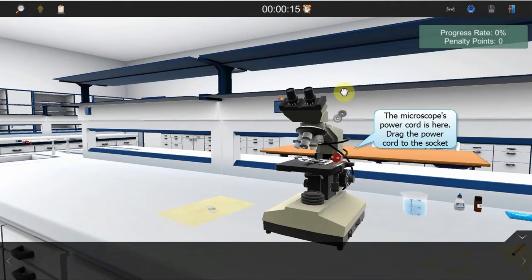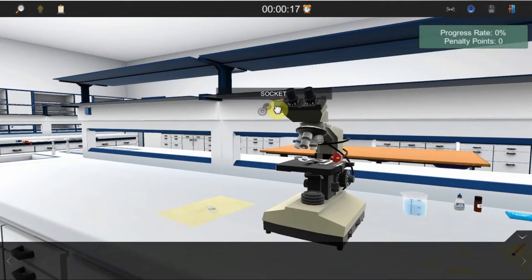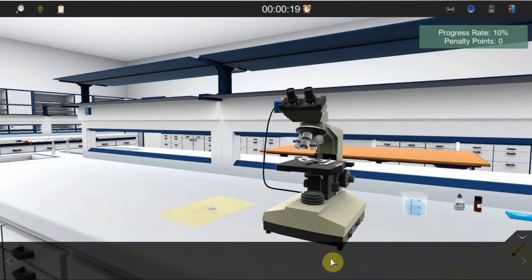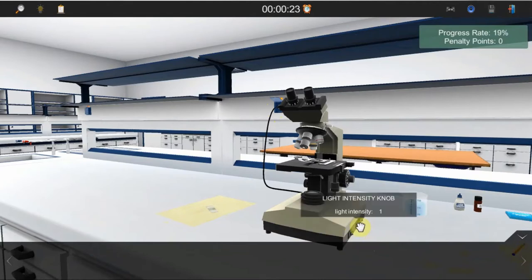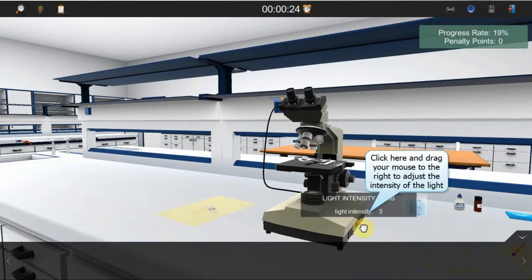Connect the plug of the microscope into the nearest socket. Turn the light of the microscope on. Adjust the light intensity to 18 by rotating the light intensity knob to the right.